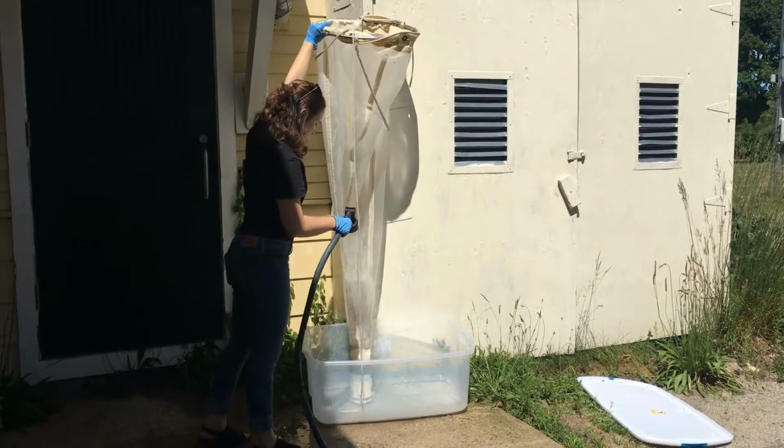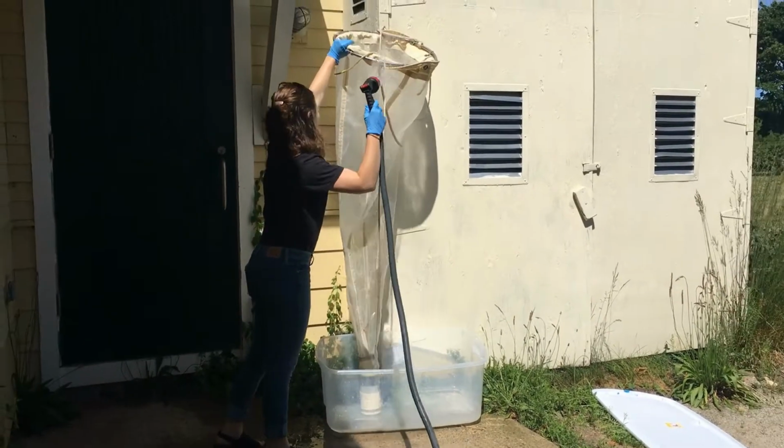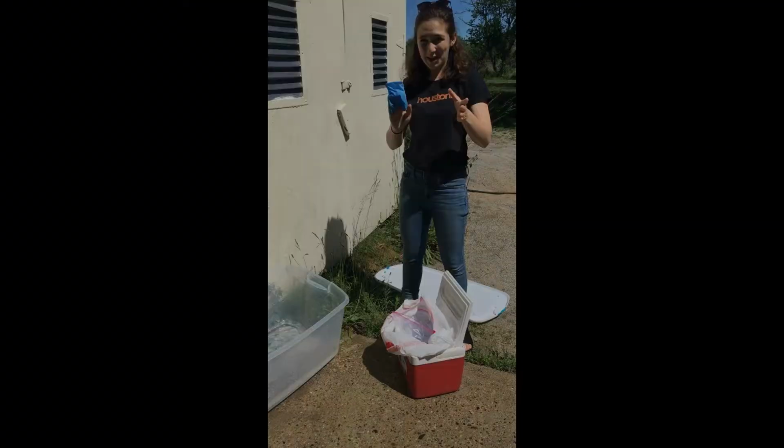I'm going to rinse off everything. If there's anything still on there that's not been killed by the bleach, it's going to be collected in this water sample that I'm about to grab.